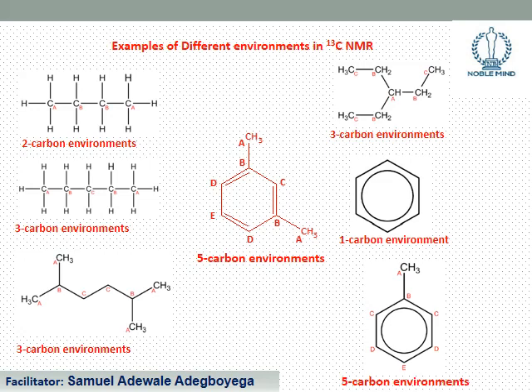All carbons in an unsubstituted benzene ring have the same environment. But the amazing thing is that immediately you introduce a substituent, it changes how the environment appears. If you want to know the environment, look at each carbon and at which atoms it is bonded to.